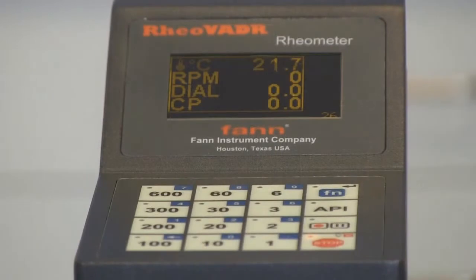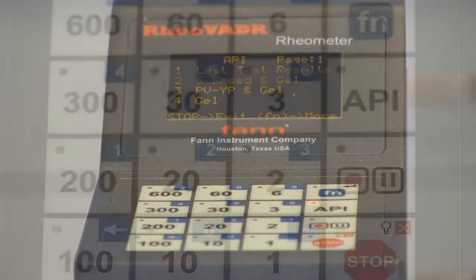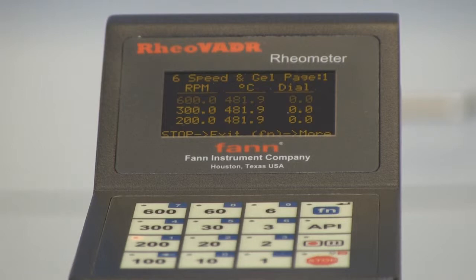The Rheovator Rheometer comes out of the box with programmed API test routines. Just touch the API button and select your test. Your test will run automatically. Or you can select from 12 preset speeds, or you can enter any speed from 0.01 RPM all the way to 999 RPM.